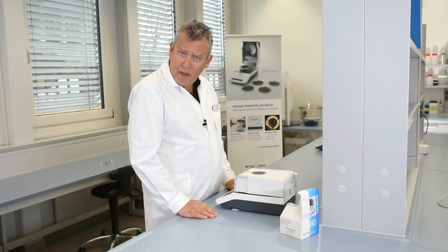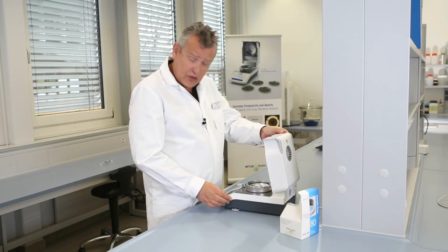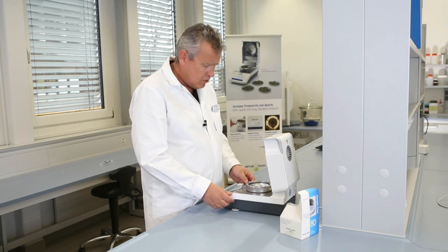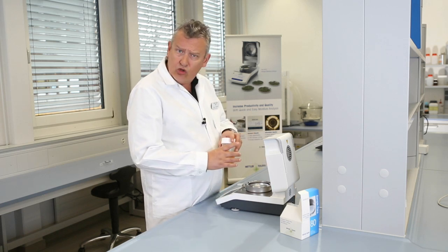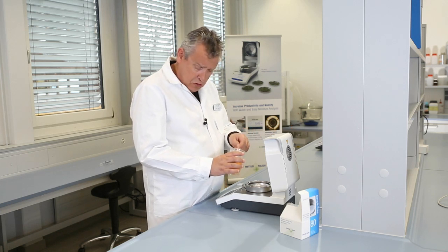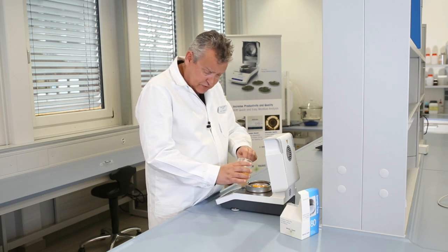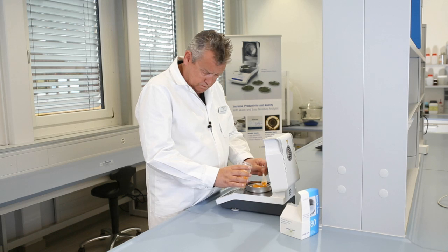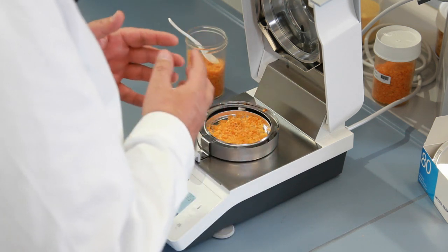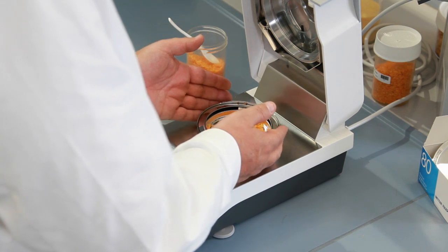Correct sample preparation and careful handling is the key to getting repeatable, accurate results. You should always try to weigh in the same amount of sample, typically 3 to 5 grams, like this, but it's a good tip to use the same amount as far as possible each time.